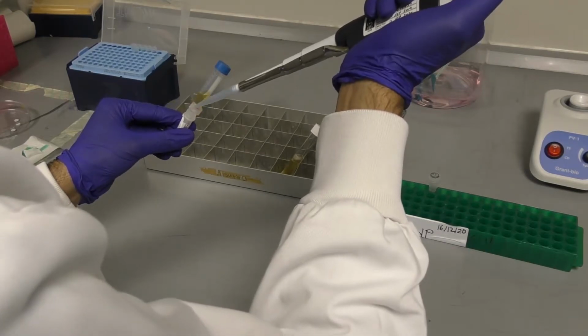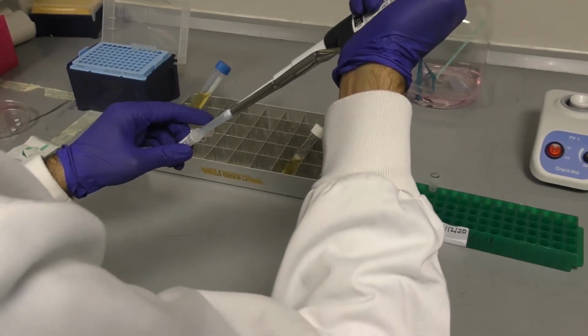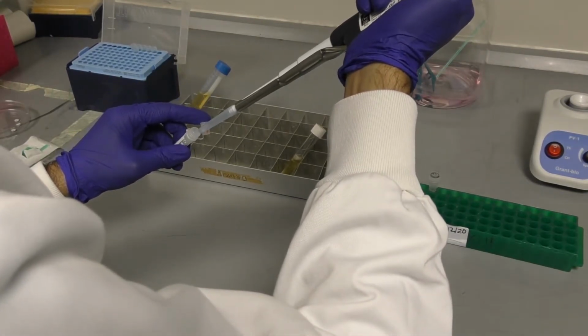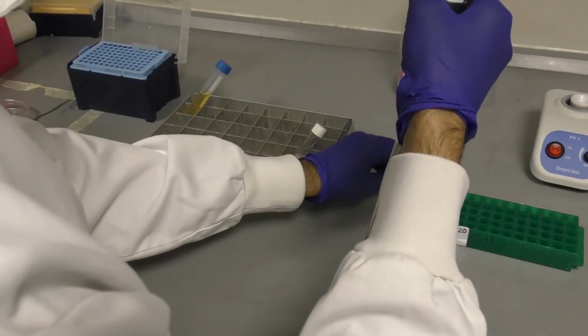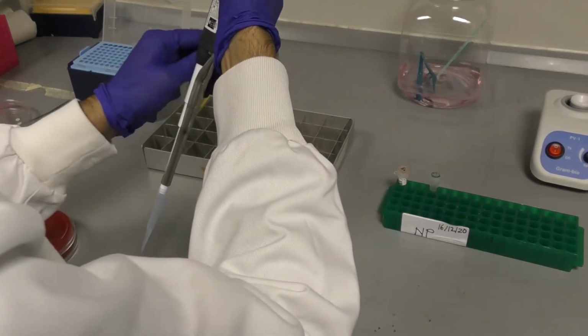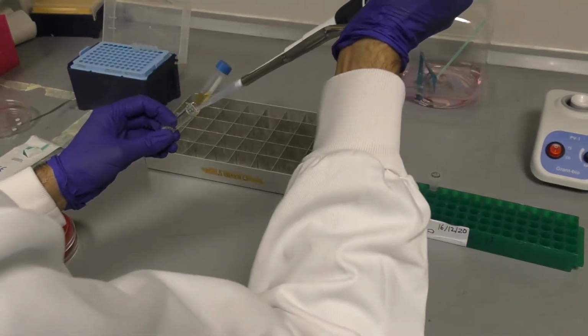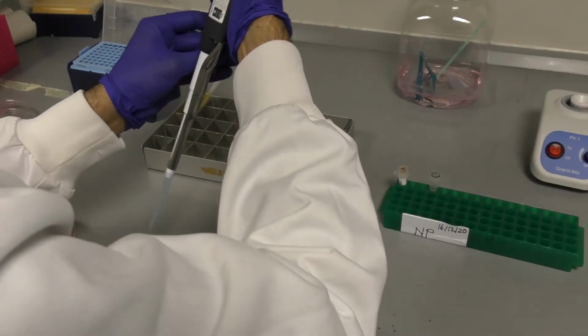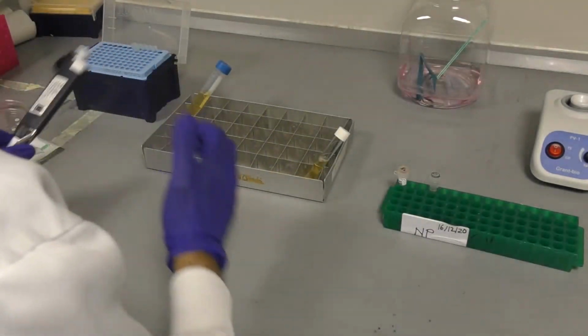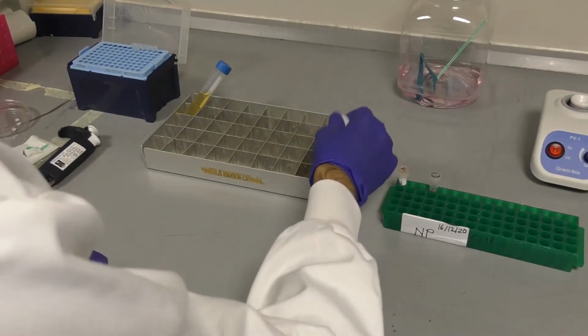Once your THY tubes are labelled, open the matching specimen vial and aseptically transfer 200 microlitres of the vial 5 STGG aliquot into the THY tube. You then need to vortex the inoculated THY tube and place it in a rack to go into the incubator at 37 degrees for 4 to 6 hours.